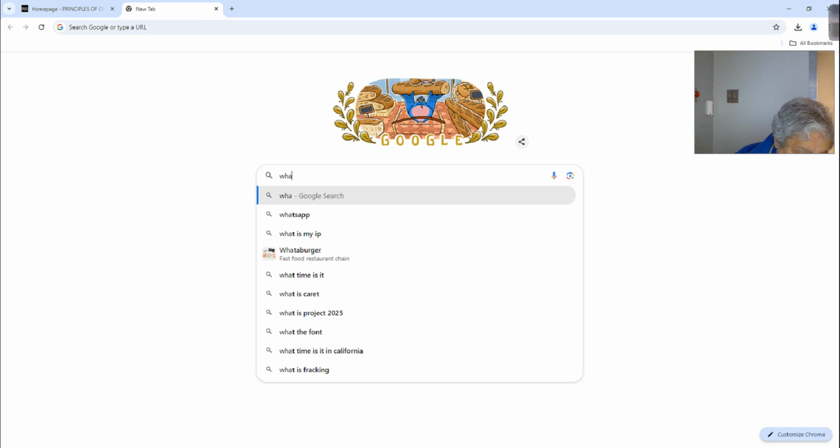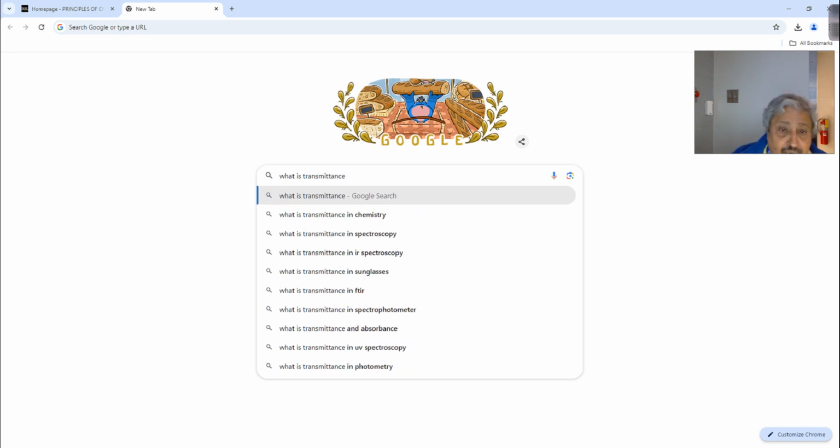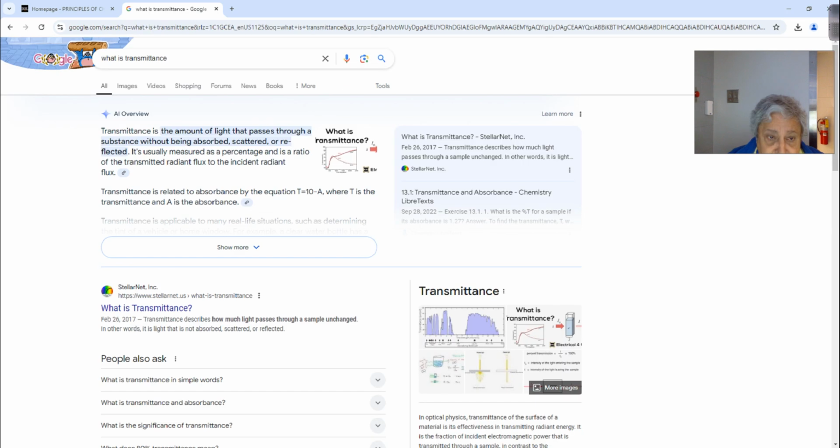Okay. What is transmittance? I hope it will come. So let's see. So the transmittance is here, and it's the relationship.